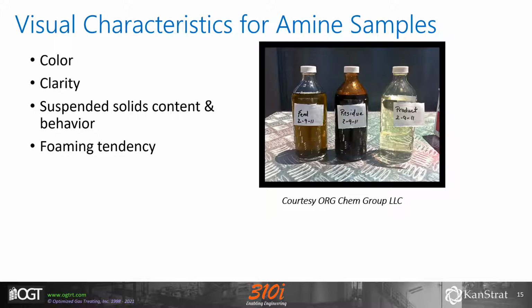You can also do some simple shake tests for foaming, but there are also more complicated tests you can do with an air sparger and a frit. The vendors have some standardized methods that they use to say how long it takes to break foam, and sometimes you can learn from those tests just how foamy your amine sample is. The problem with these tests is once you take the sample out of the pipe, the sample cools, solids settle, and you may not have the exact conditions that you had in the process. We've seen cases where the amine sample looks good and doesn't foam in the lab, but the system outside is actually a raging foam beast.